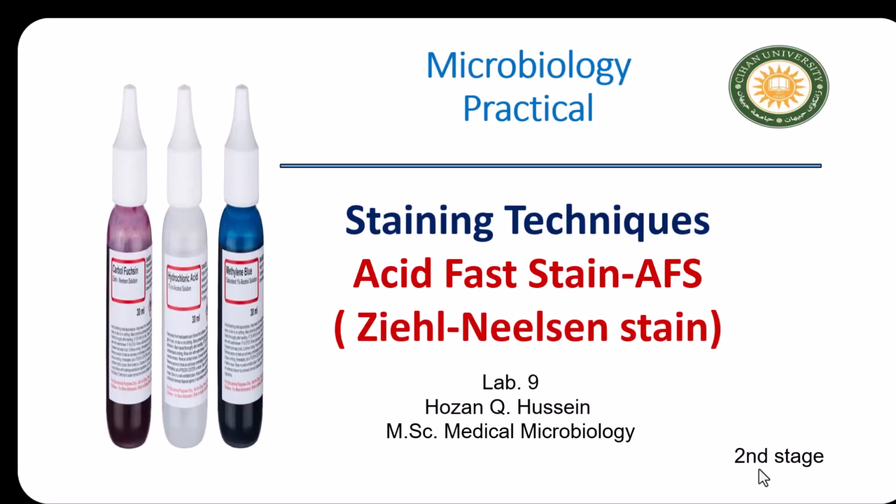Hello everyone. Today we explain lab 9, which is about the acid-fast stain. It is also called Ziehl-Neelsen stain. It is the most important differential stain used in the microbiology lab because it allows us to identify medically important bacteria such as Mycobacterium tuberculosis, which cannot be stained by using ordinary stains like the Gram stain.